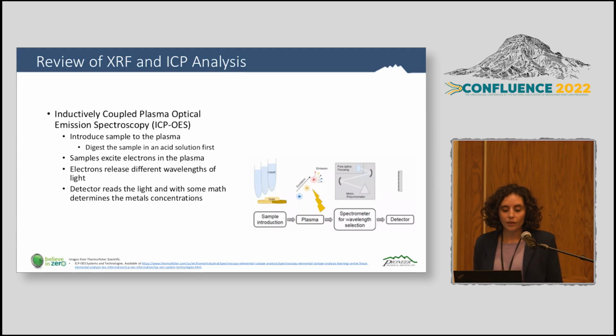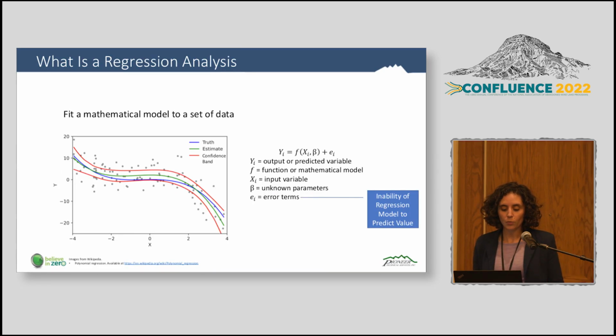So what is a regression analysis? For the most part, what we're trying to do is fit a mathematical model to a set of data. You get a y, an output value or a predicted value, that is a function of an input variable, some unknown parameters, and then you usually have an error term.